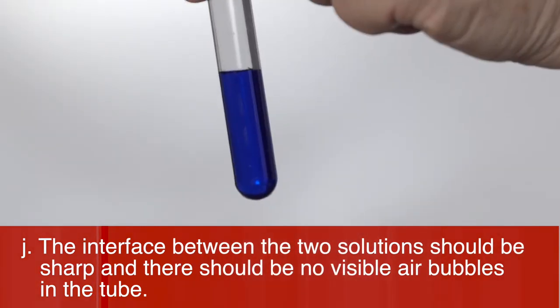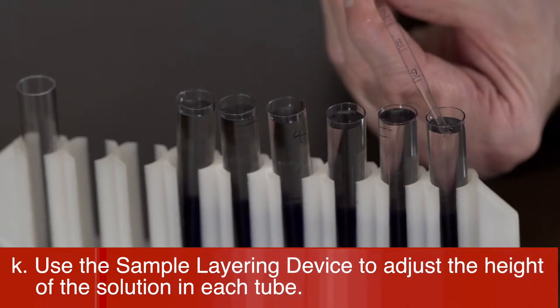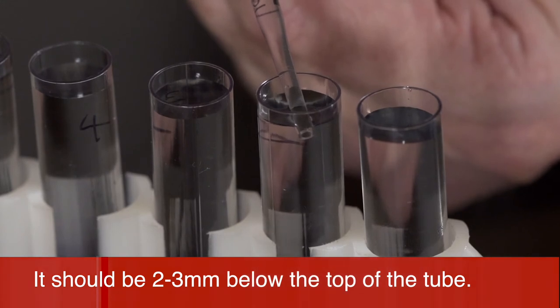The interface between the two solutions should be sharp and there should be no visible air bubbles in the tube. Adjust the top level of the light solution using the sample layering device so that it is two to three millimeters below the top of the tube.